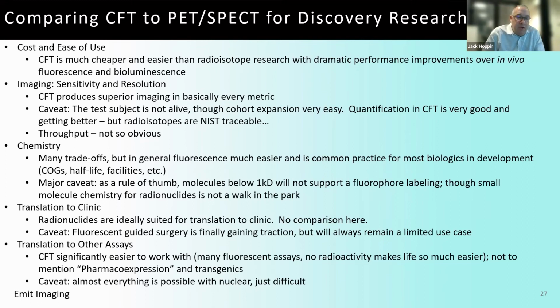And on studying transgenics and pharmacoexpression, I think we shocked a lot of people looking at the distribution of fluorophores in those two arenas. People had a perception of what was happening, and then they really saw what was happening, and it wasn't what they thought. I think we made some people happy, and we've made some people upset when we've looked at GFP expression and other expressors in the modality.